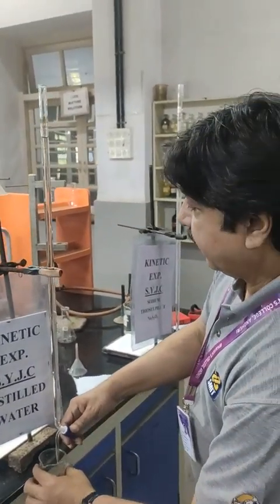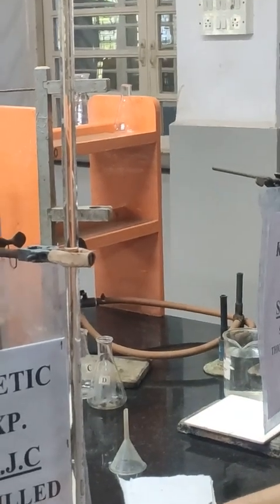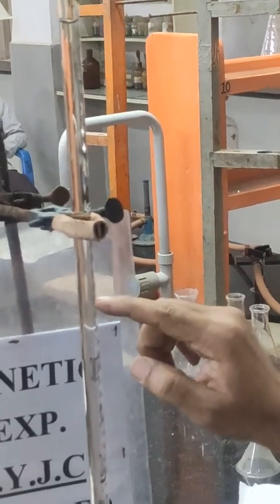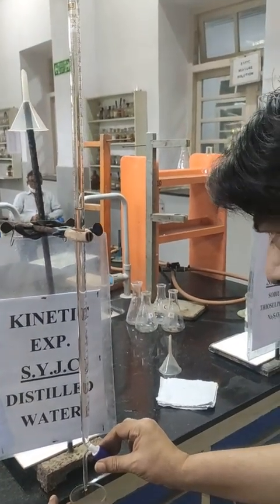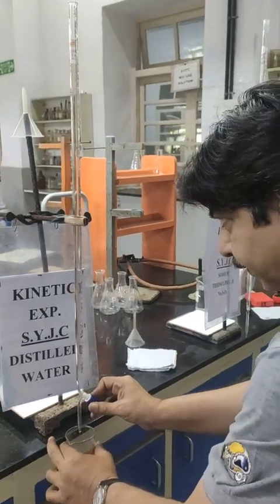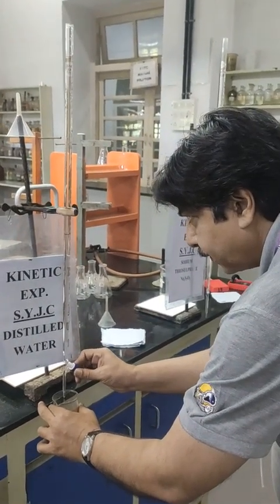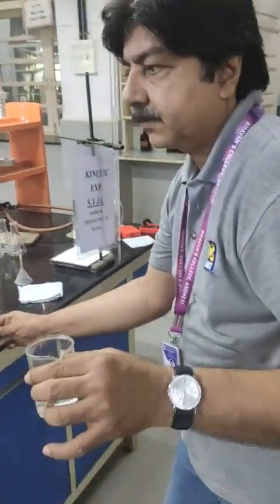So let me begin from here. I have taken 28 ml.